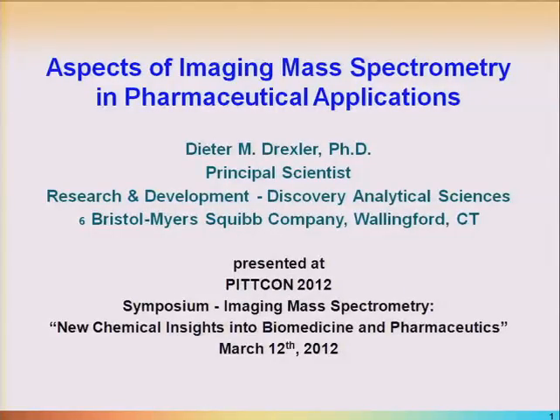Today I will discuss the aspects of imaging mass spectrometry in pharmaceutical applications and how imaging mass spectrometry assists in developing new medicines.